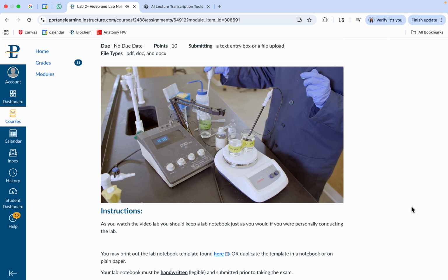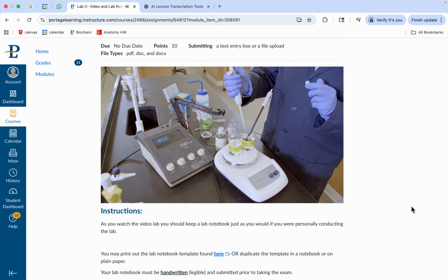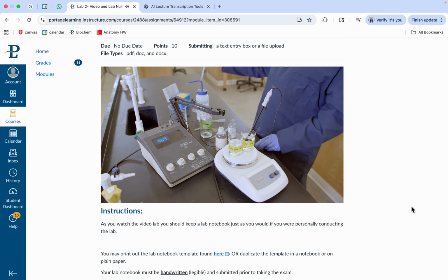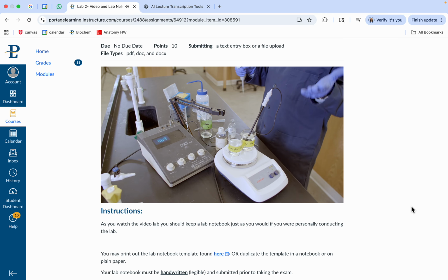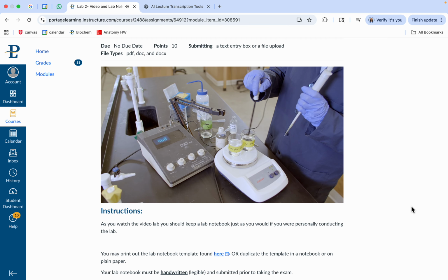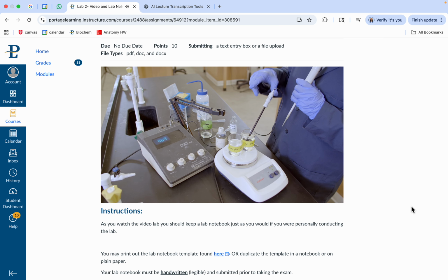Again, it goes down to about 9.68, but then pops back up. Some of that dropping and quickly moving up is just diffusion, and then we'll add another volume. Notice this one does drop a little bit more, and we're down to about 9.68, 9.69. So the glycine is really helping to maintain the pH at that 9.6. Now, I wouldn't do it for every pH, but it does it right around 2.35 and around 9.60. I can add some more base here to show how much it goes up, and again, it resists pH change both ways. Notice it goes from 9.68 to 9.69.